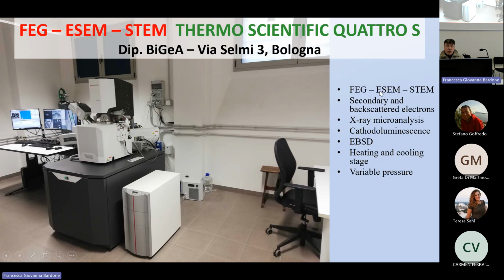The system is also, you see here, this E is for environmental SEM. This means that if you have a hydrated sample, a wet sample, or a sample in which you want to preserve the biological condition, you don't need to evacuate the chamber. Because if you evacuate the chamber, you remove gas and you remove water, for example, from biological material.